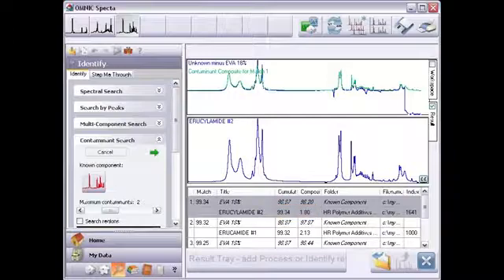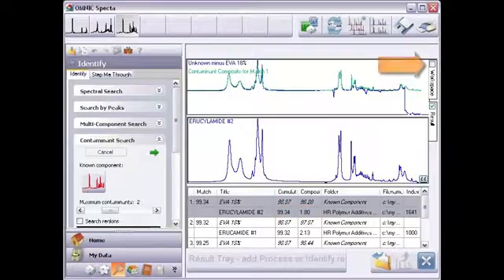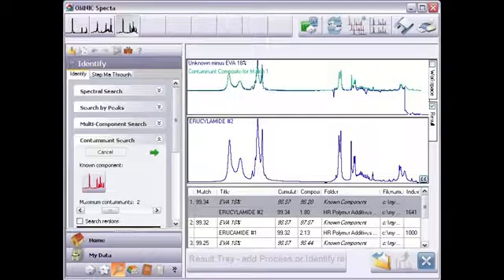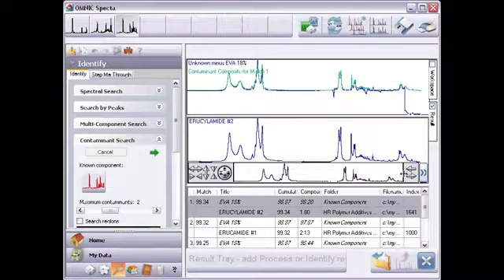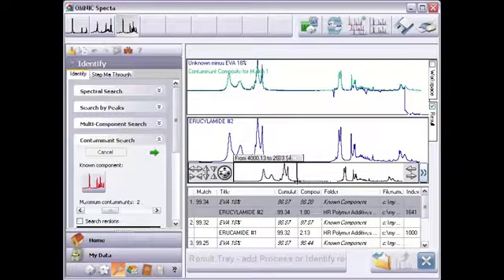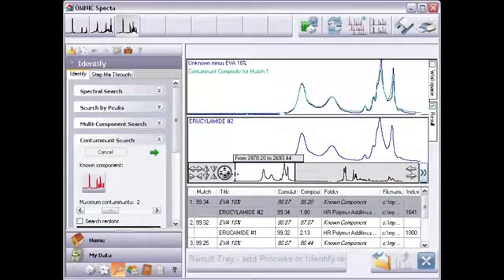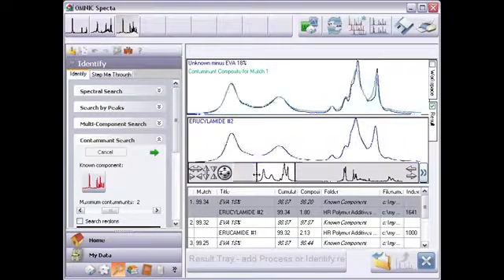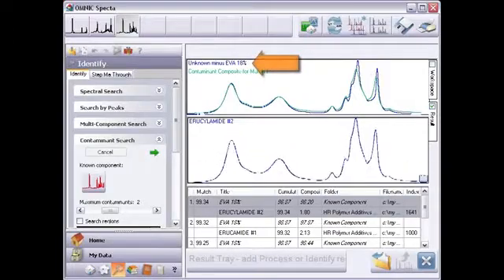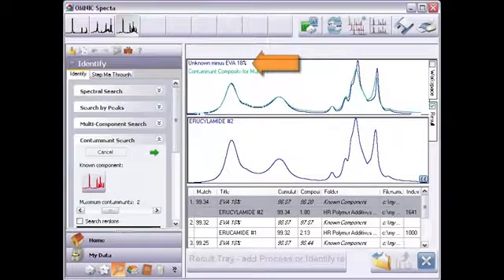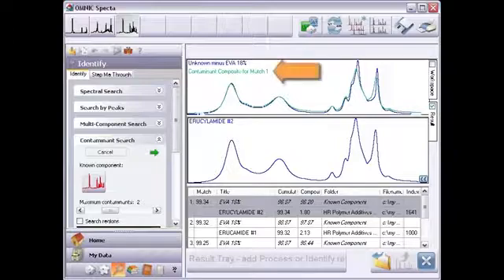Note that for the contaminant search, the workspace pane is automatically hidden. The spectra in the result pane are usually sufficient for this analysis. I'll use these controls to zoom in for a closer look. This pane shows the sample spectrum without the contributions from the known component, essentially a residual spectrum. The other spectrum is a composite of the found contaminants. This display is most helpful when there are multiple contaminants.